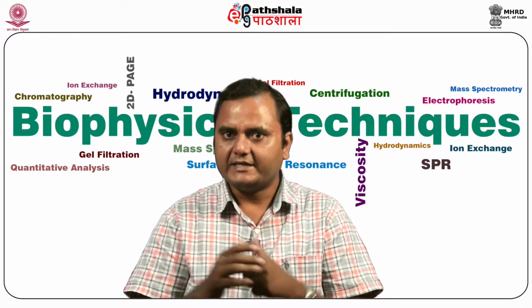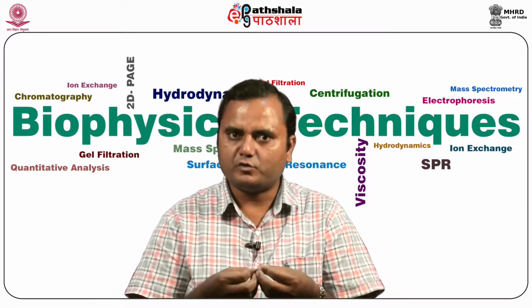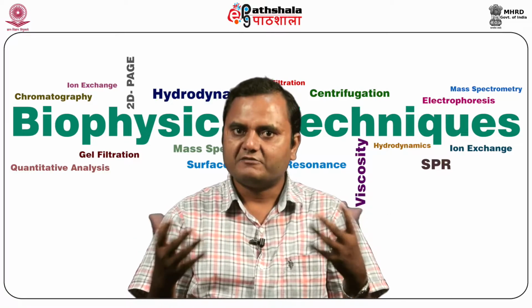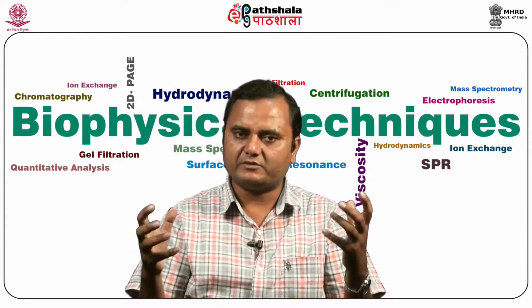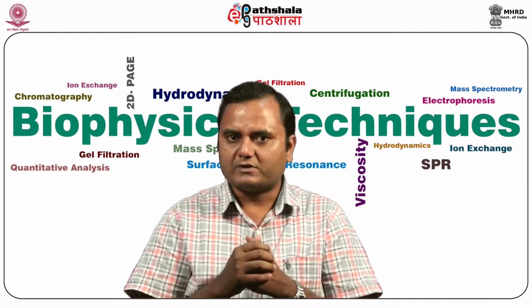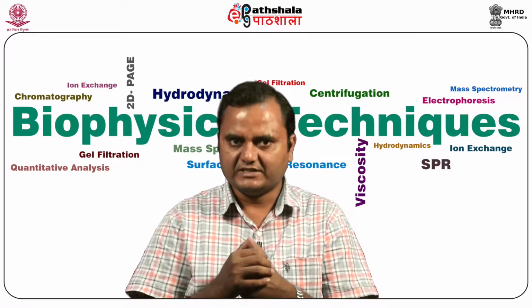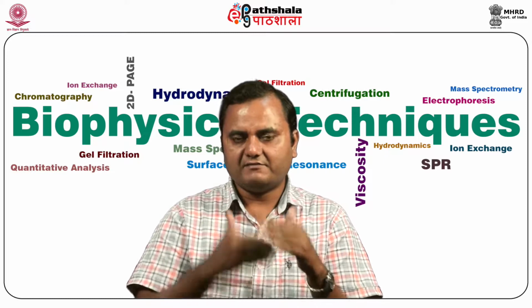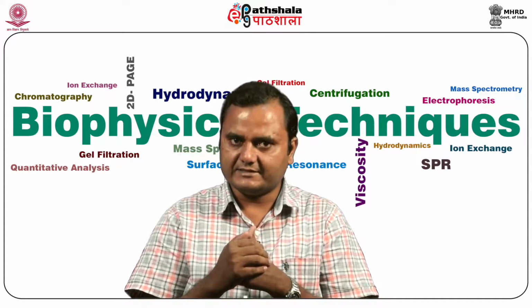In the same way, you can see how these monomers assemble together to form big complexes, what the stoichiometry is, and what the ratio of the molecules is that could bind together to form a complex. Then it also gives you an idea about the equilibrium constant for self-associating and dissociating systems. So these are very wide and most useful applications in biological science.